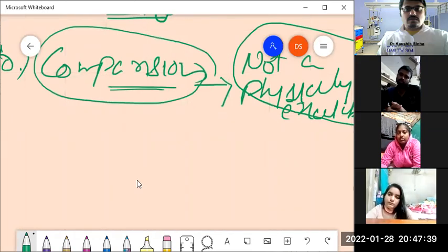That means the histologist already knows what to expect under the microscope if the tissues be normal. So with that knowledge of what is normal, if the histopathologist puts his or her eye into the eyepiece, whatever can be seen immediately gets compared against his or her knowledge of the normal structure.